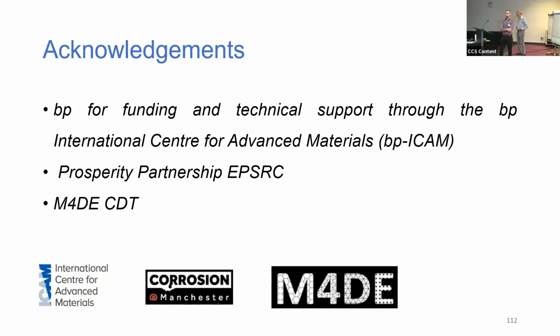I guess I wanted to understand a little bit about how you're doing the correlation to the EBSD. There are lots of ways that people try to put fiducial markers onto surfaces. One way I've seen people do it is, right at the end of an AFM experiment, you crash your tip on the surface, and then you can find that in your EBSD maps. So that was one question.